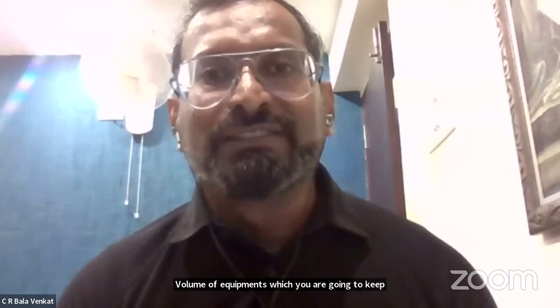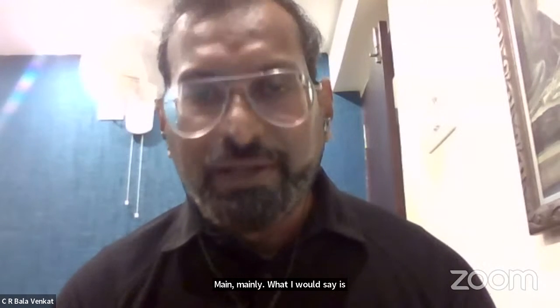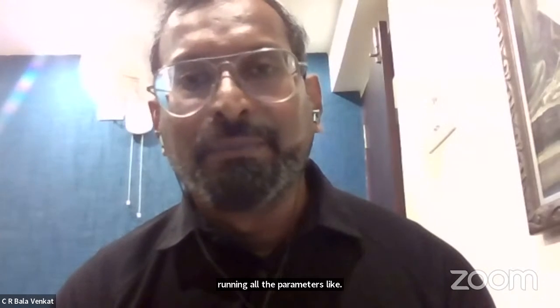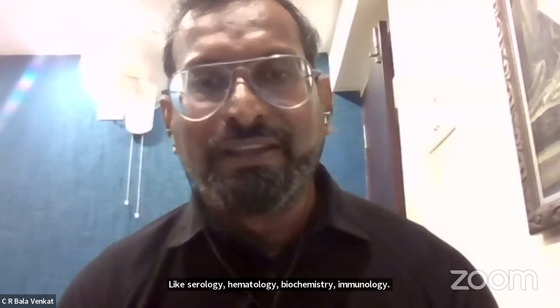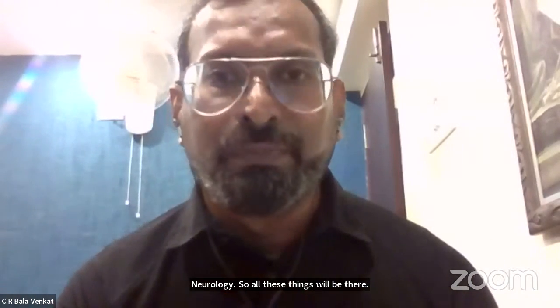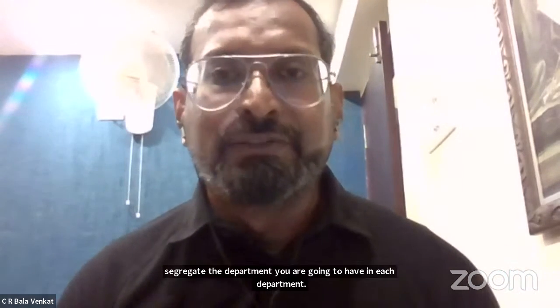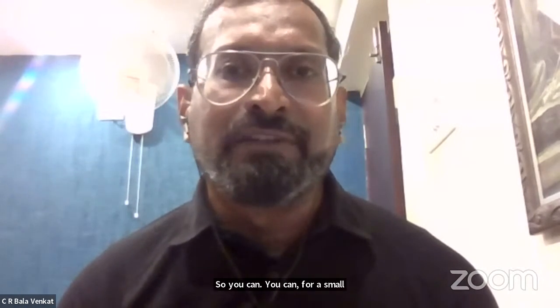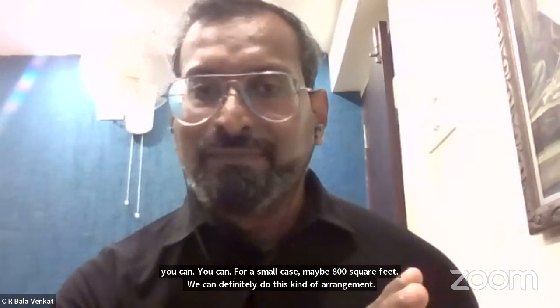Mainly, if you have basic parameters, everyone will be running all the parameters, like serology, hematology, biochemistry, immunology, urinology, and microbiology. We have to segregate the departments, how many equipments we are going to have in each department. So accordingly, the space can be defined. For a small case, maybe 800 square feet, we can definitely do this kind of arrangement, which looks really good. You can maintain it.